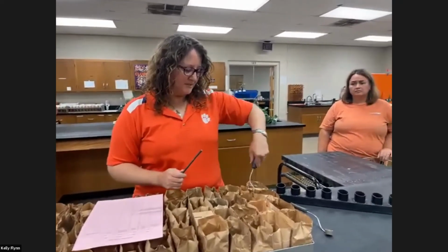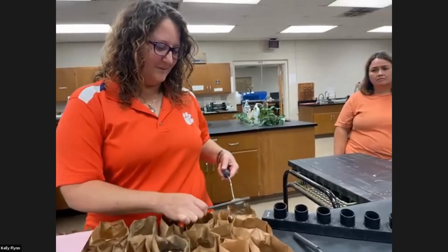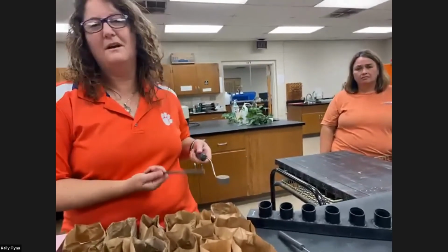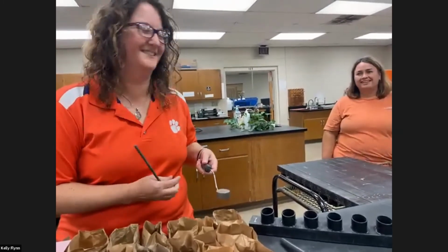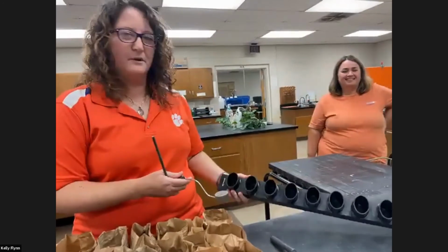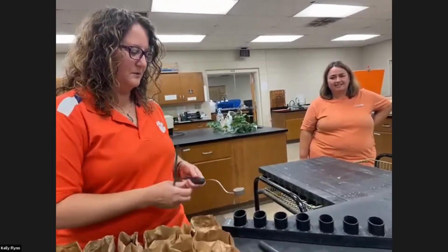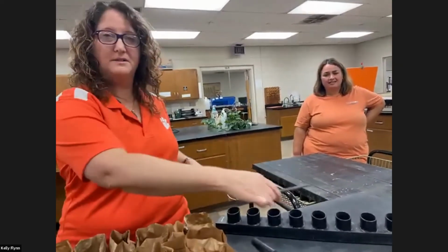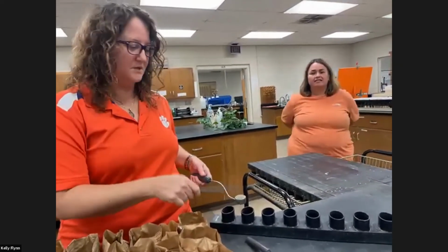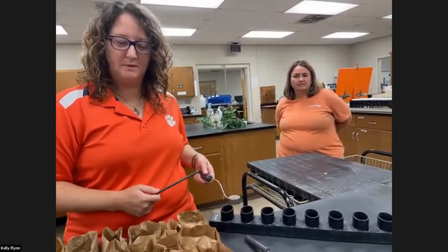We just scoop a sample, tap. This is a standardized procedure. Scrape, so that we've got, it's kind of like sifting flour, right, for cooking a little bit. And we've got these cup systems for our extraction process. So we're going to scoop every sample into a cup. And these are all numbered so that we know which sample goes in which cup so that we don't get anything out of order. So we know exactly which sample we're working with.